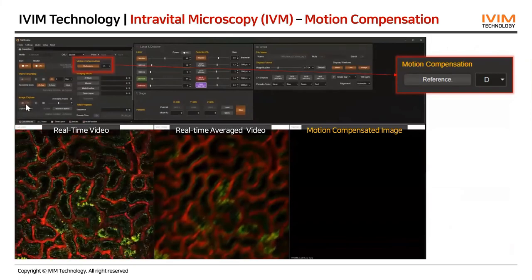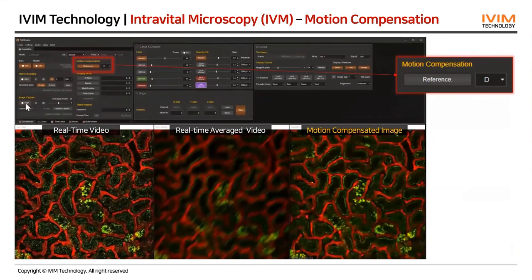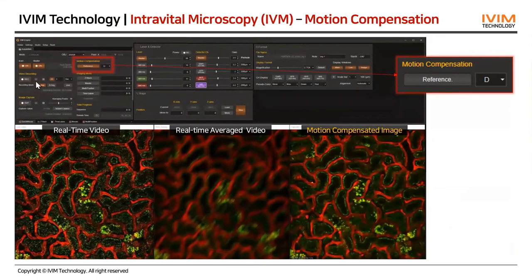And it would really come down to, do you have the right mice to do this? And can you learn the surgery? With the expertise that you guys have, it's a lot easier to plug and play as opposed to us getting a 2-photon from somewhere else, and then we have to figure out how to rig it to do brain imaging, and how to rig it to do heart imaging. So this is the reason I'm really excited about this.